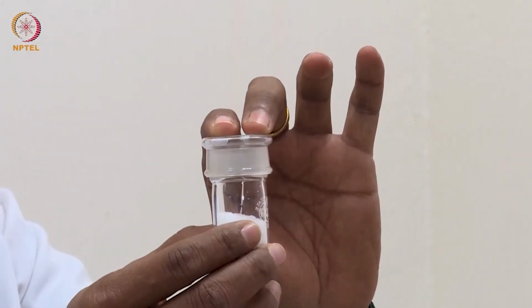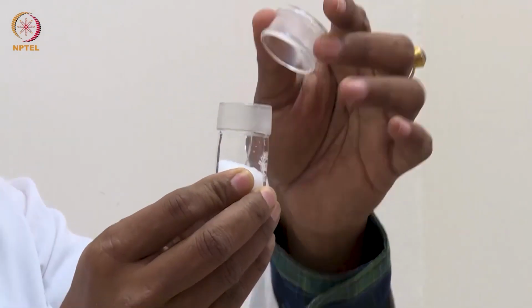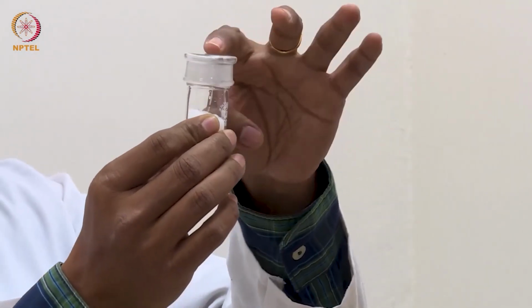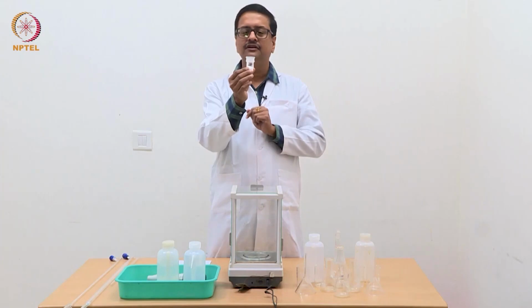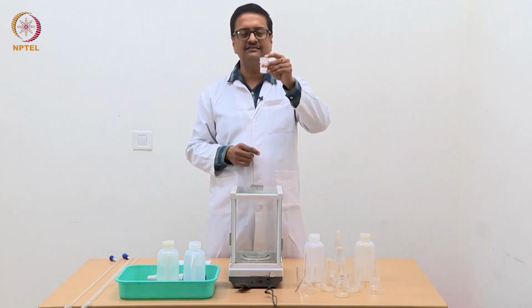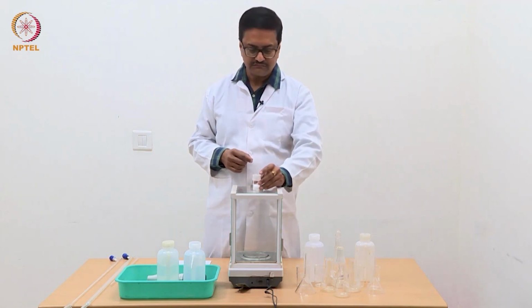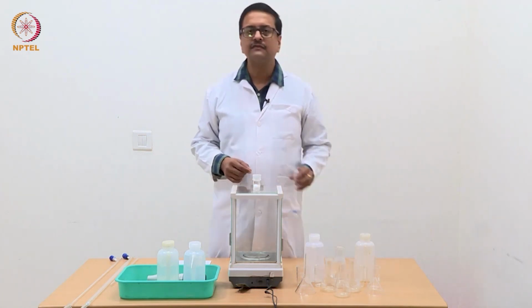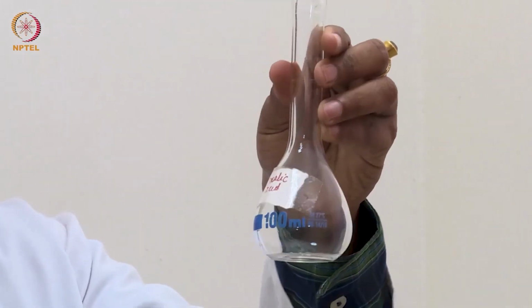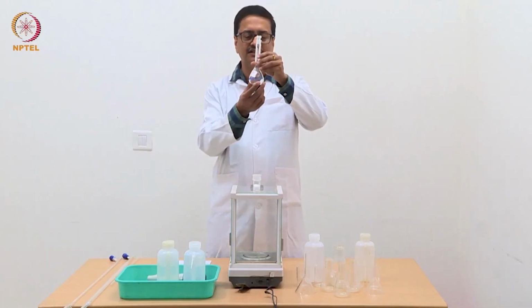This is a particular type of bottle, which we call the weighing bottle. You can see that we have the groove here and the lid, and this comes in a pair. When you have the bottle and the lid and you take oxalic acid in this, we will use this weighing bottle to do the weighing. To prepare a primary standard solution, you will need a volumetric flask, which I have labeled as oxalic acid because this will be my primary standard oxalic acid solution.